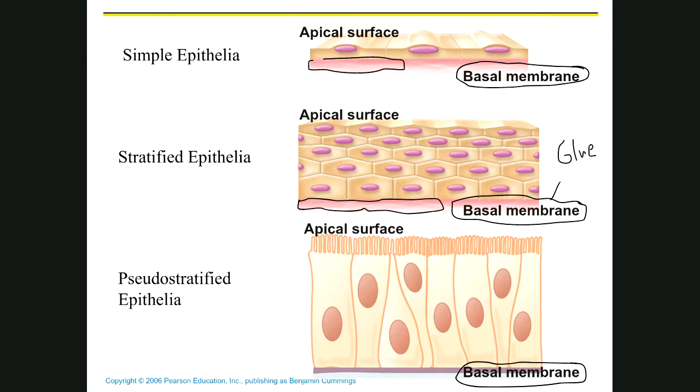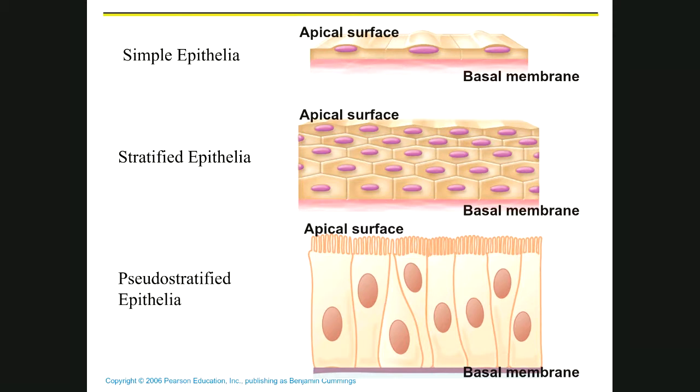And then the other thing we're going to look for is an empty space. There's space out here. There's space right here. And there's space here. That space could be the external environment. It could be the inside of a cavity. It could be all kinds of things, but it's space. It's empty space.